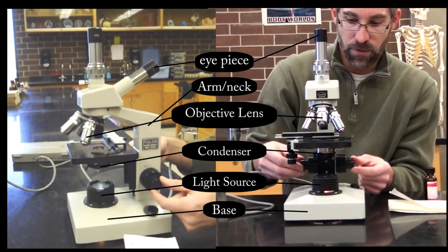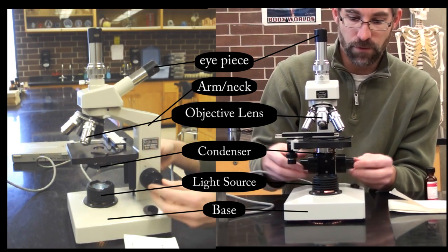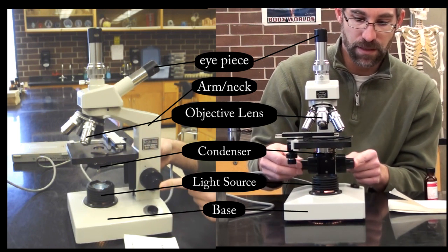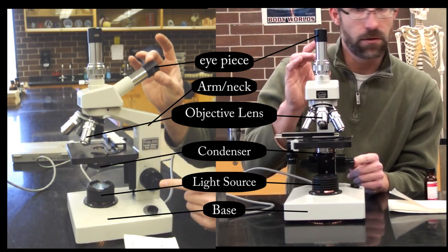As we move out, we have what we call a fine adjustment knob. So once we get it roughly in focus, we can use this fine adjustment to get it really nice in focus as we look through the eyepiece.